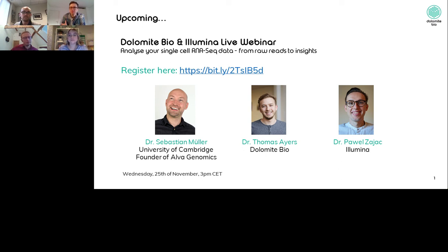I think leading on from Adam's point as well, on a hardware basis, it's worth me mentioning at this point that generally blockages of the Nadia microfluidic chip are not occurring due to cells. Generally, that can be from overloading of beads or various different things, and that comes from the fact that the Nadia junction itself and the Nadia filter, the smallest point there, is around 50 microns across, which means that unlike maybe some other microfluidic platforms that may have a 30 micron aperture, it is more tolerable to, for example, large cell sizes.